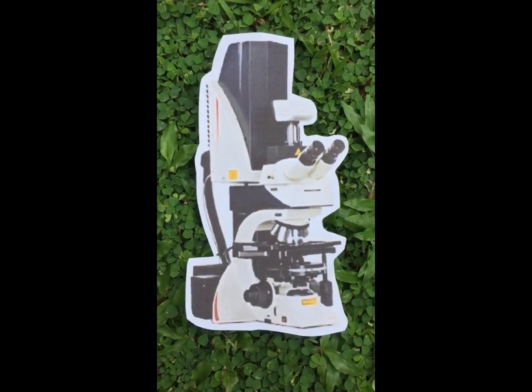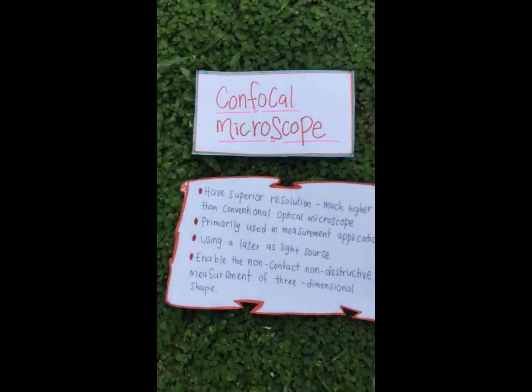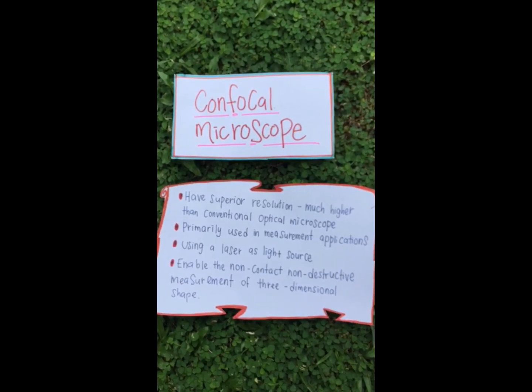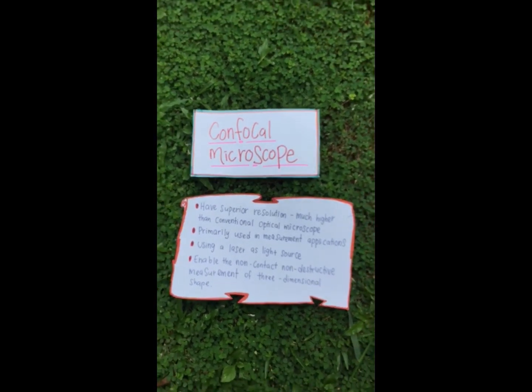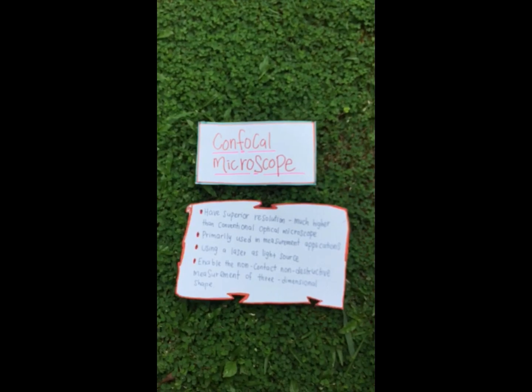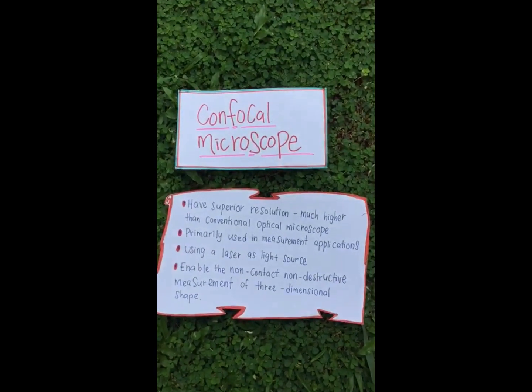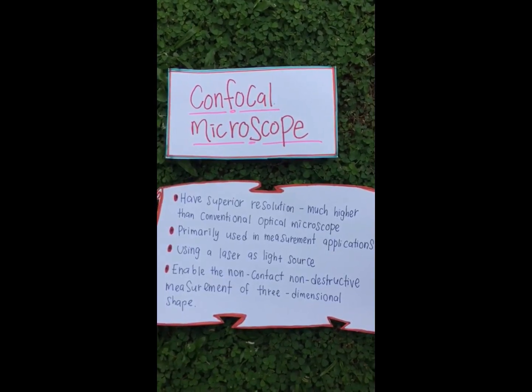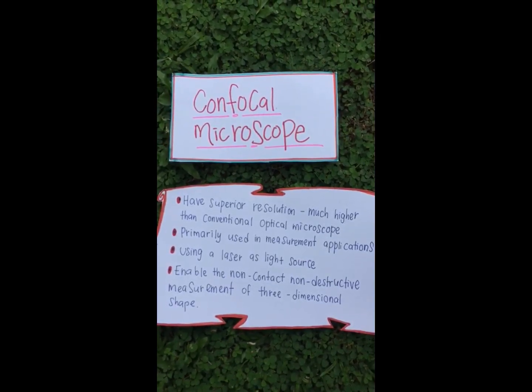Next is the confocal microscope. Confocal microscope has superior resolution, much higher than a conventional optical microscope. It is primarily used in measurement applications. It uses a laser as a light source. Confocal microscope enables the non-contact, non-destructive measurement of three-dimensional shape.